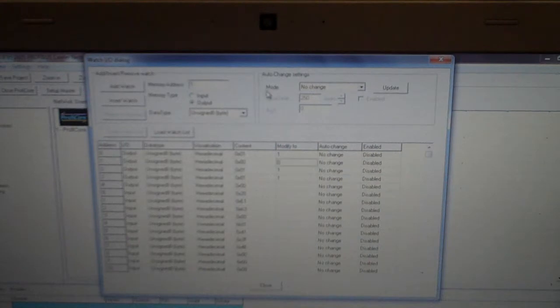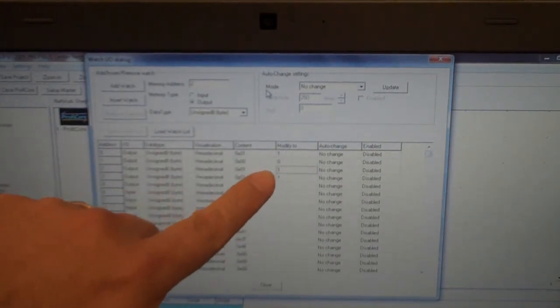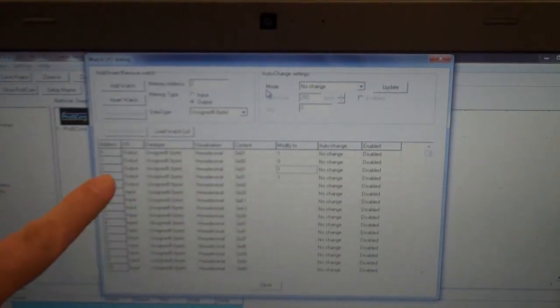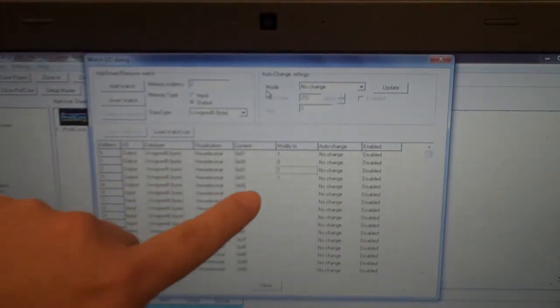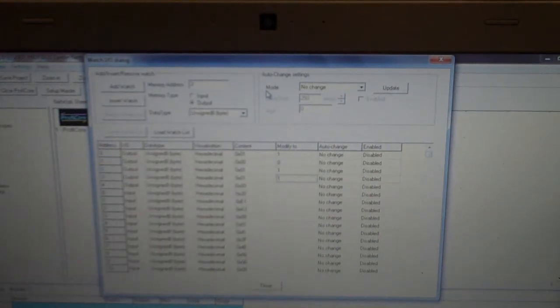But the ones that are special for selecting the application in the 4060 or GC Pro are the next 2 bytes, bytes 2 and 3. So if you set byte 2 to true, to 1, you can then use byte 3. You can use it to command which application will come on.